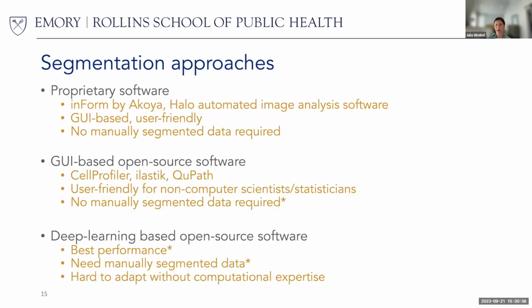So there are 3 different buckets of approaches for doing cell segmentation. Some of them are proprietary software that comes bundled with hardware that companies like Akoya, which have the most popular platform for this, give you. Usually they're GUI based and user friendly. They don't require training data, but I think their accuracy sometimes leaves something to be desired.